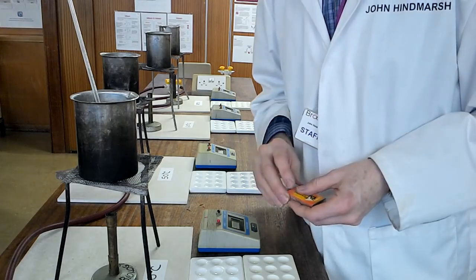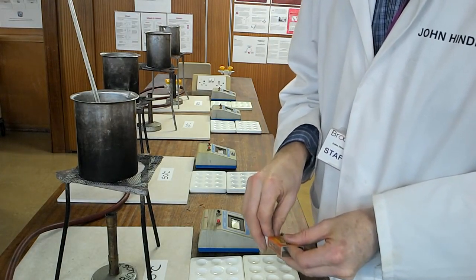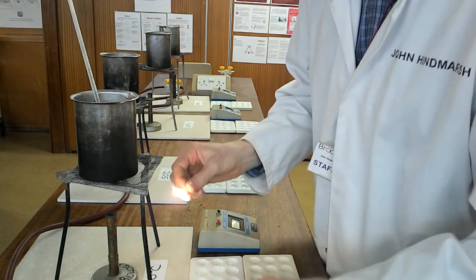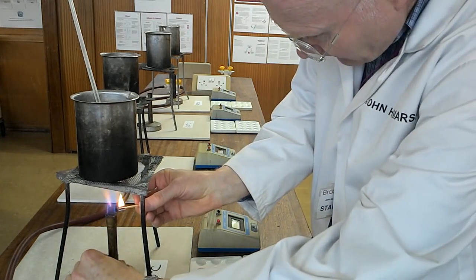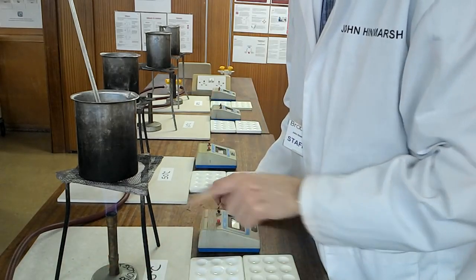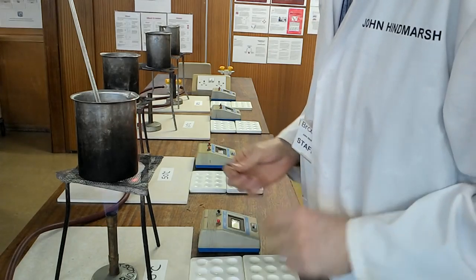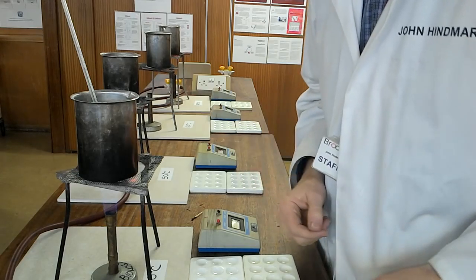Right, in order to measure the enzyme activity of amylase at different temperatures, first thing you need to do is prepare your water baths. So we warm up some water baths. So we've got a range of temperatures: 40, 50, 60, 80 degrees and 20 degrees room temperature. Okay, so warm that one up.